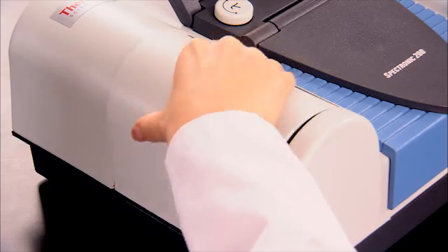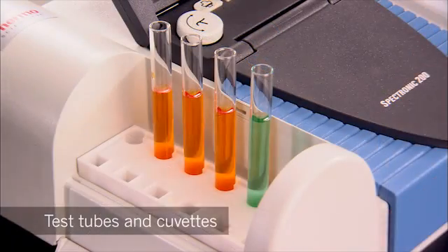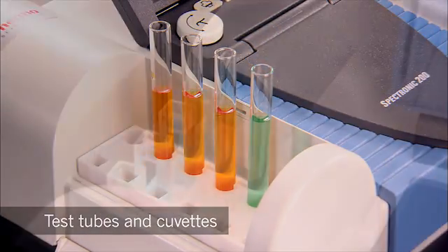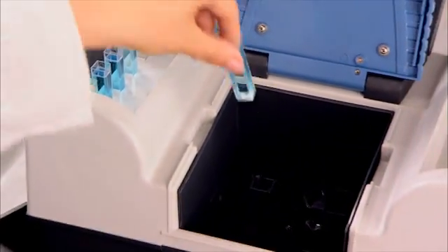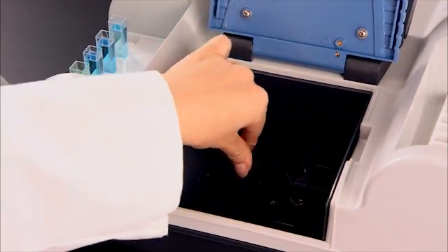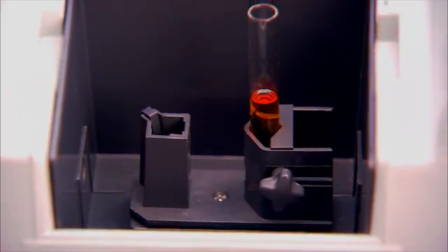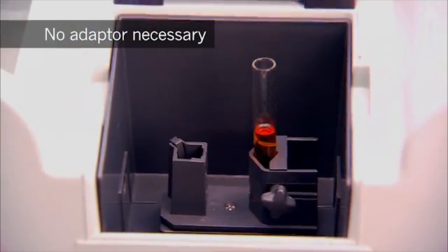The SPEC 200 includes racks and compartments for test tubes and cuvettes that make prepping and testing easier to do and manage. The larger, more accommodating sample compartment accepts cuvettes and test tubes of varying sizes, no adapter necessary.